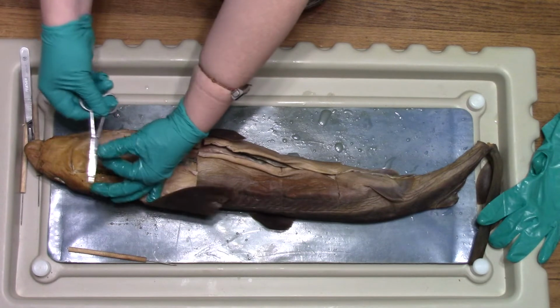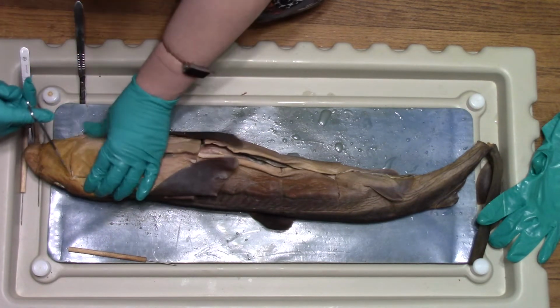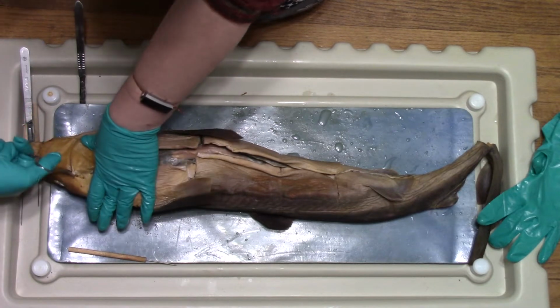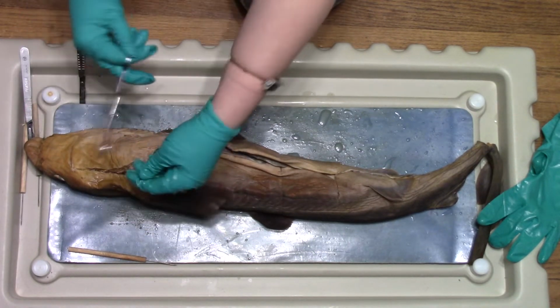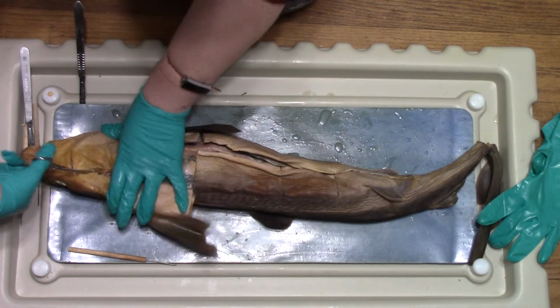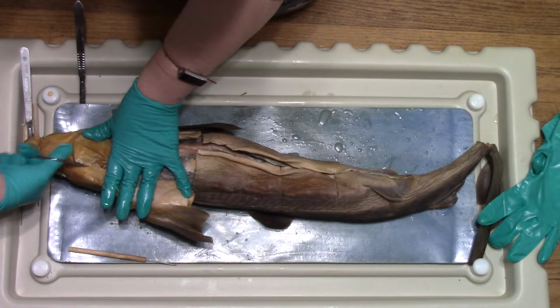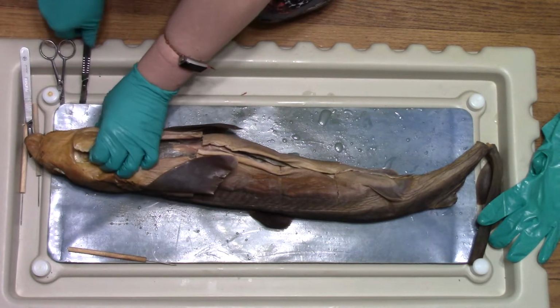I'm trying not to touch it with this glove so this glove doesn't get quite as greasy as this glove. One of my favorite rules generally is to try and keep one relatively clean hand and one really dirty hand. Because I'm right-handed, I typically try to keep my right hand my cleanish hand.